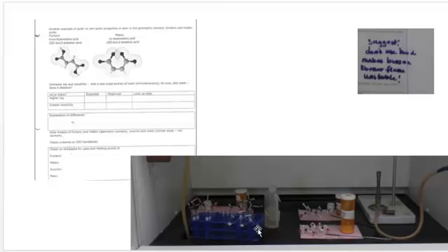One of the things to investigate is melting point, and you need to put a similar pea-size piece in each of 2 small test tubes. Using the test tube holders, heat them both at the same time, and just look for which one melts first. We're not asking you for a temperature, we're just asking you for which one has the lower melting point.